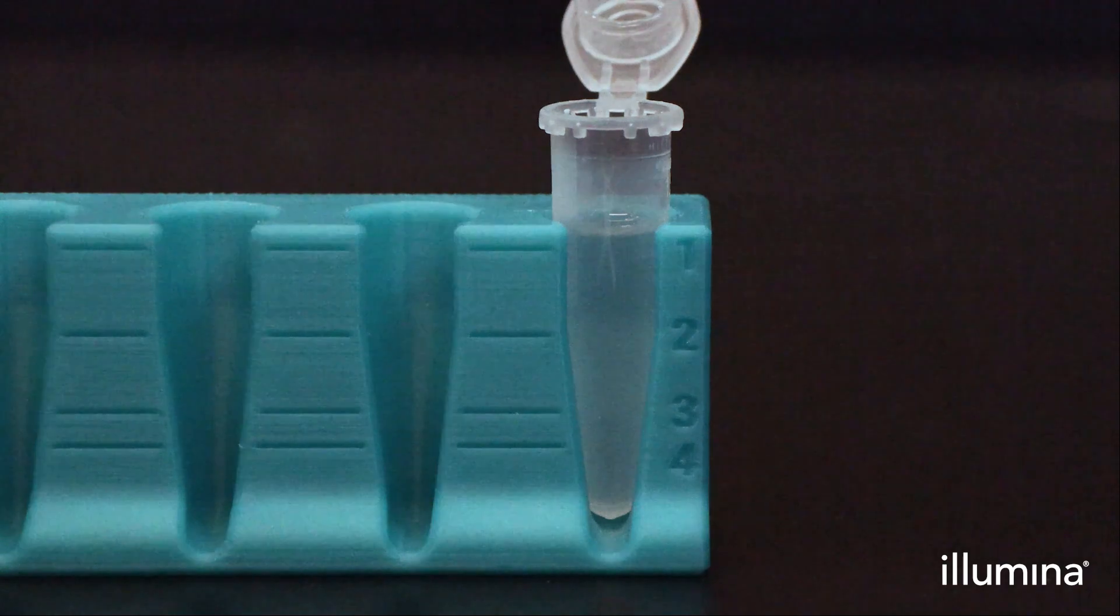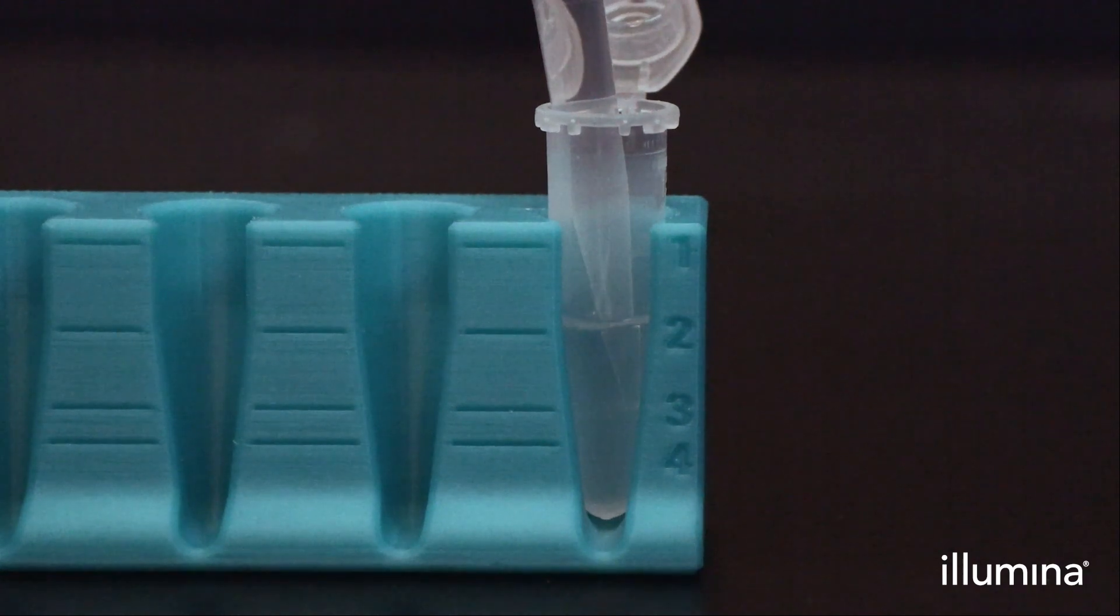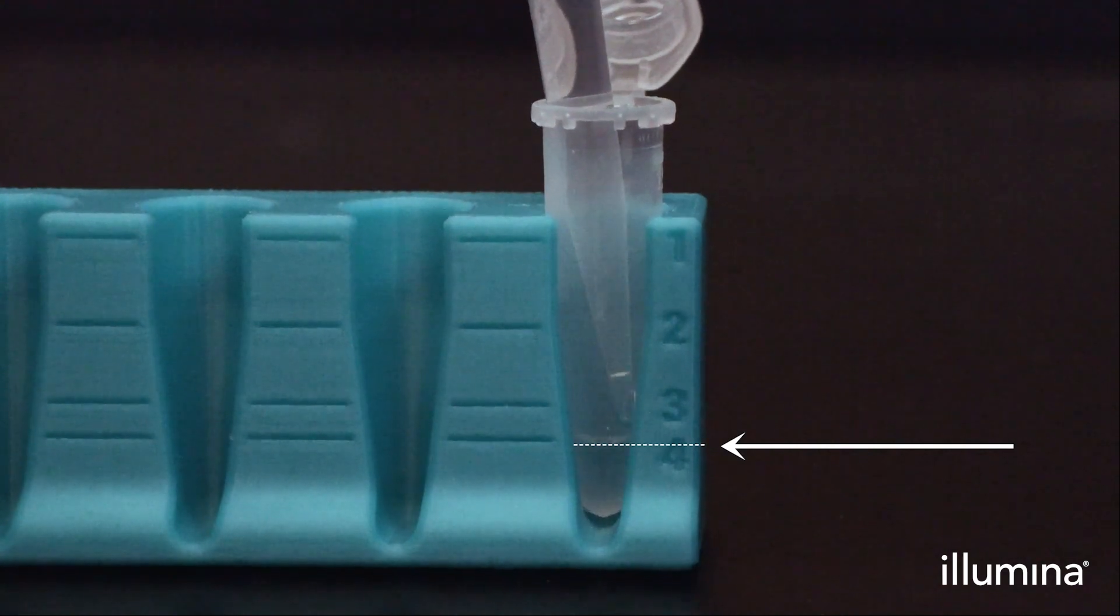Aspirate and discard the aqueous supernatant to the 40 microliter marker on the tube stand without disturbing the pips pellet. Add 1 mil more of 1x wash buffer and repeat these steps to perform four total washes before moving on to volume regulation.